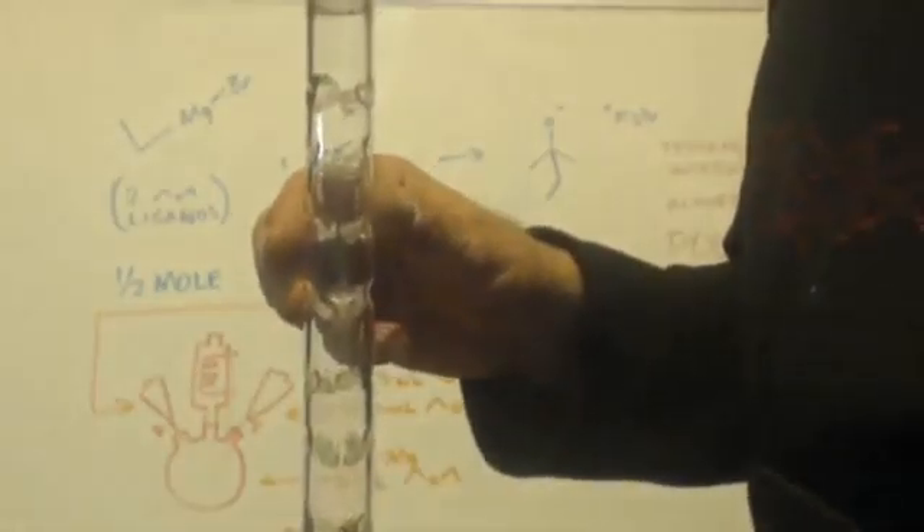What I suggest, if you want an air-cooled condenser, get a Vigrex column like this. That way you can also use it as a Vigrex column on your distillation if you want straight up and down instead of like a condenser. If you've got the choice between an air-cooled condenser and a water-cooled condenser, never buy the air-cooled. Water-cooled is always best because if you really want to use a water-cooled condenser as an air-cooled condenser, you can — just put room temperature water into it. I always use it as a Vigrex column.